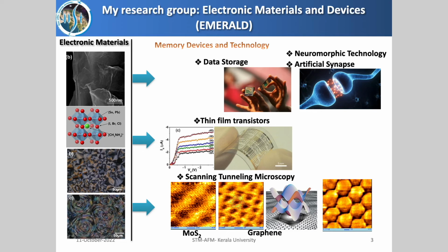For example, you see this is an STM image of graphene. We know graphene has a hexagonal structure, right? But that's not exactly what you see here. You see triangles here. There's a triangle, there's a triangle, there's a triangle. The reason, I will explain when we talk about STM images, is that 3 atoms in the hexagon, if there are more than one layer of graphene, the lower layer will pull down 3 atoms. So 3 atoms are down and 3 atoms are up. That's why you see these 3 atoms are up, that's why they are brighter, and the other 3 atoms are darker. So that's what I was saying: if you are not careful, you will misinterpret the STM images. These are carbon atoms.